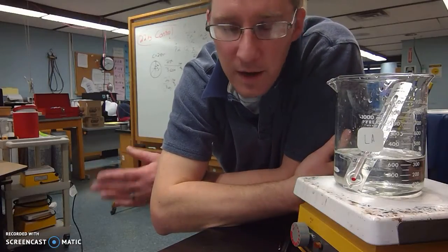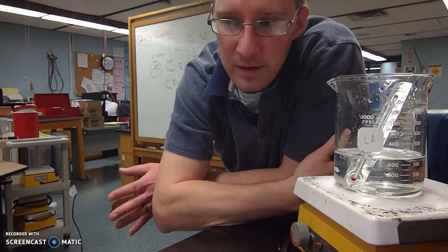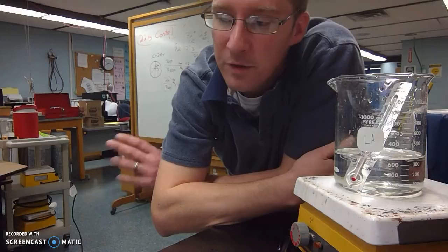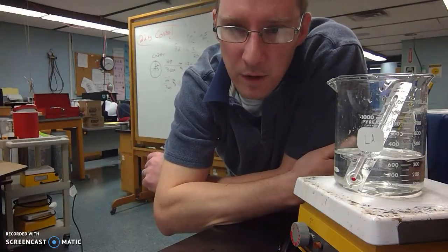In my data sheet, I gave you room for 2 data points per minute for 10 minutes. You're going to have to make that data table a little bit longer. It's not going to be hard for you to do. Just extend it, and that's it. When you've completed collecting data, dump your water, turn off your hot plate, unplug your hot plate to make sure this thing doesn't run overnight, and then you're going to take a look at some of the analysis questions.